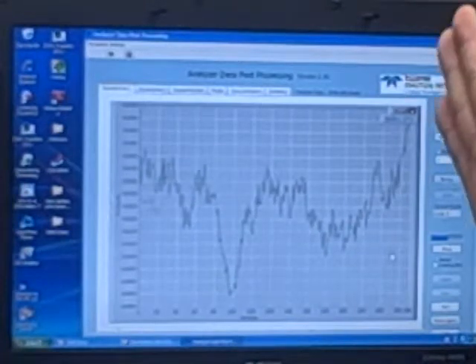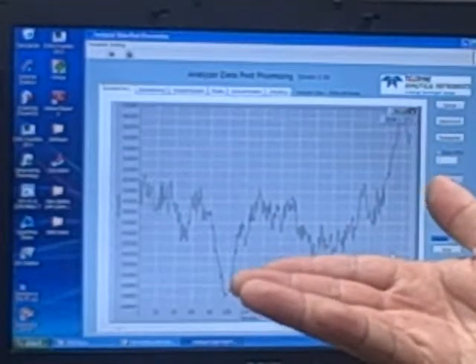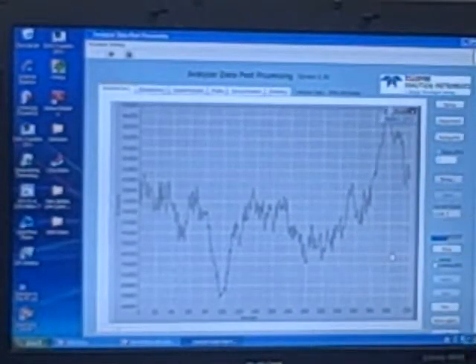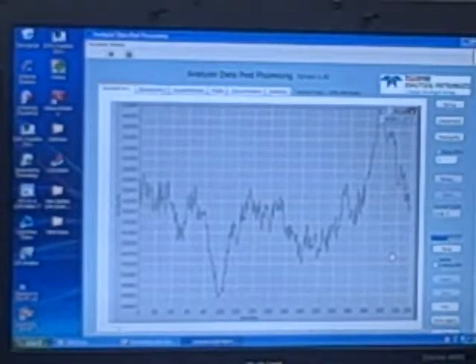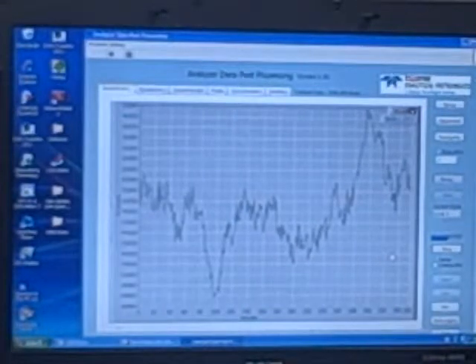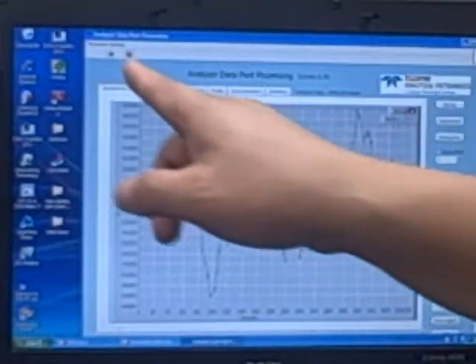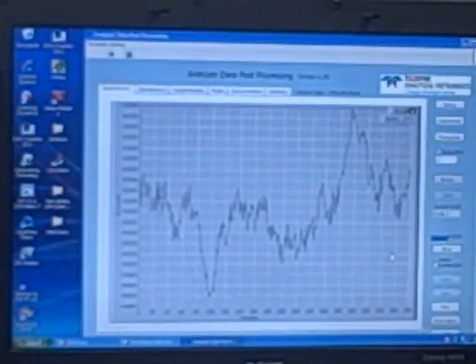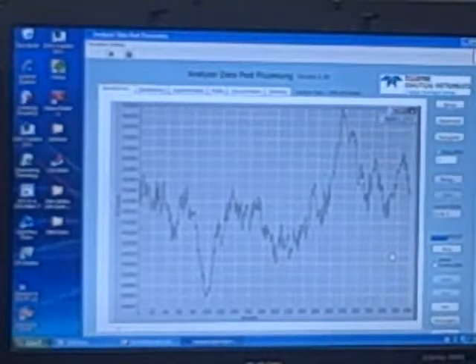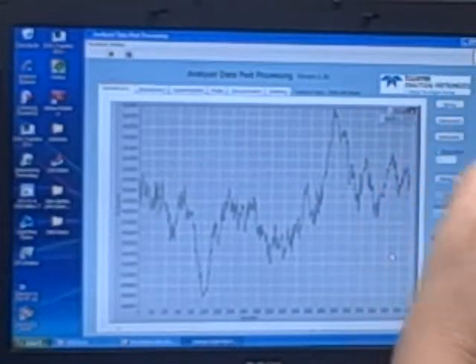So one cycle is already done, so the blue bar moves halfway. You are 50% done. If I'm measuring 100 cycles and you measure 50 cycles, the blue bar will be the same, halfway. So that's a good indication. Also, if data is not saved, the blue bar will not move. Sometimes that happens: either there are some bugs or something is wrong, settings wrong, you forgot to click OK. The blue bar will not move unless I do something. Okay? So now data keeps dumping into your file, cycle by cycle.